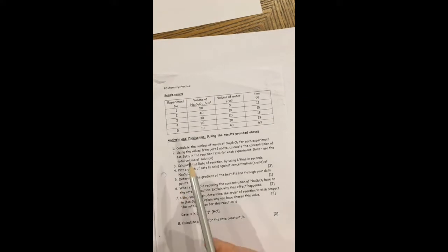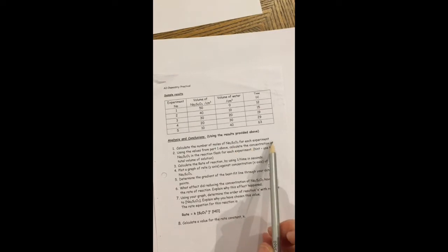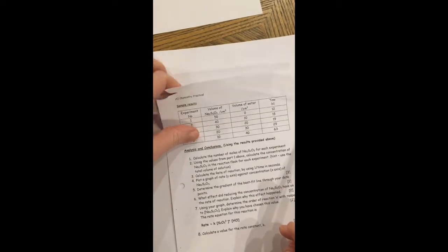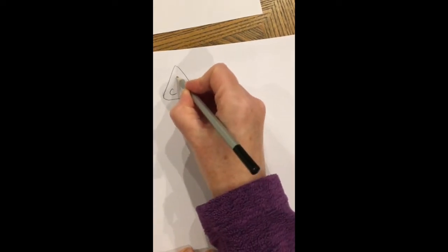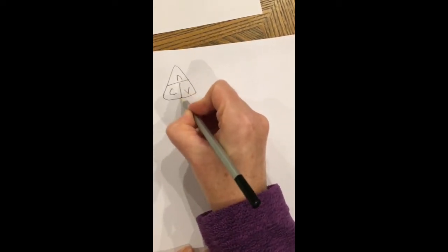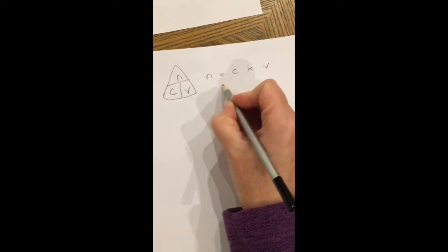Okay, so you were given steps to follow to analyse your results and to come up with a conclusion. The first job you had was to calculate the number of moles of thiosulfate for each experiment. So here we're using our relationship between concentration, moles and volume. We want to work out the number of moles, so it's concentration times by volume.